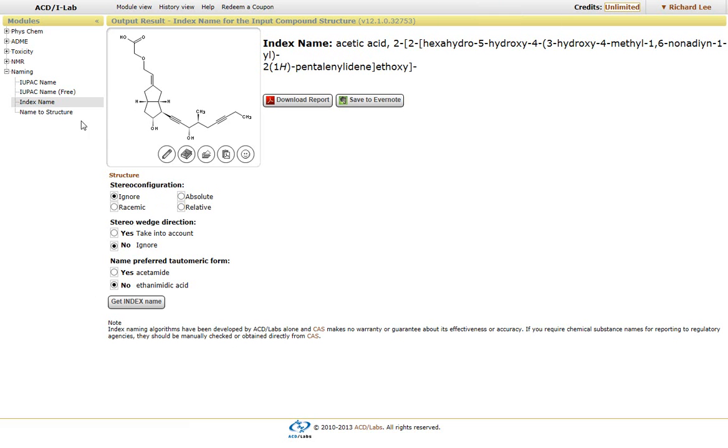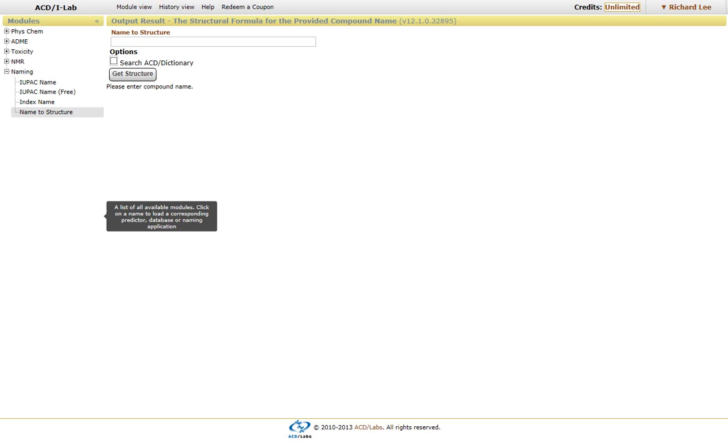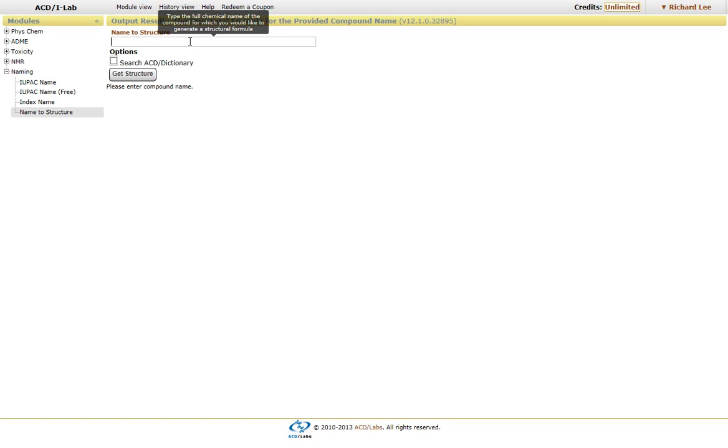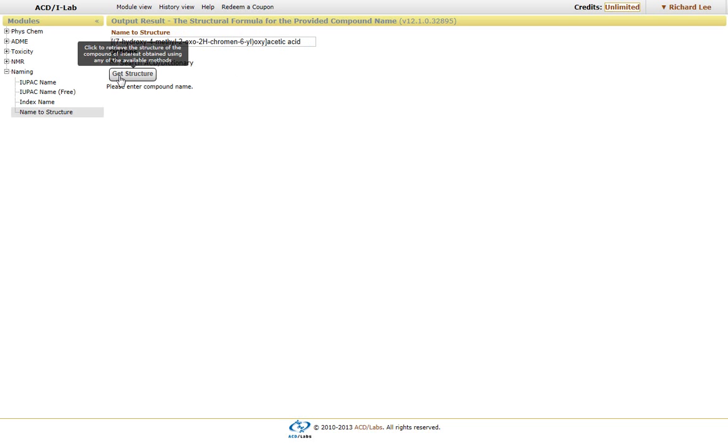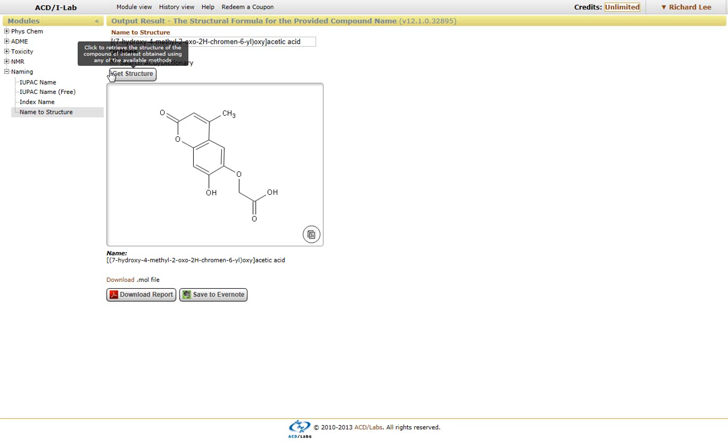We have the ability to generate structures from names. Simply click on the name to structure module you see here. I'm going to copy and paste the name and place it into this line and click on get structure. It will generate a structure based on the name that you have entered.